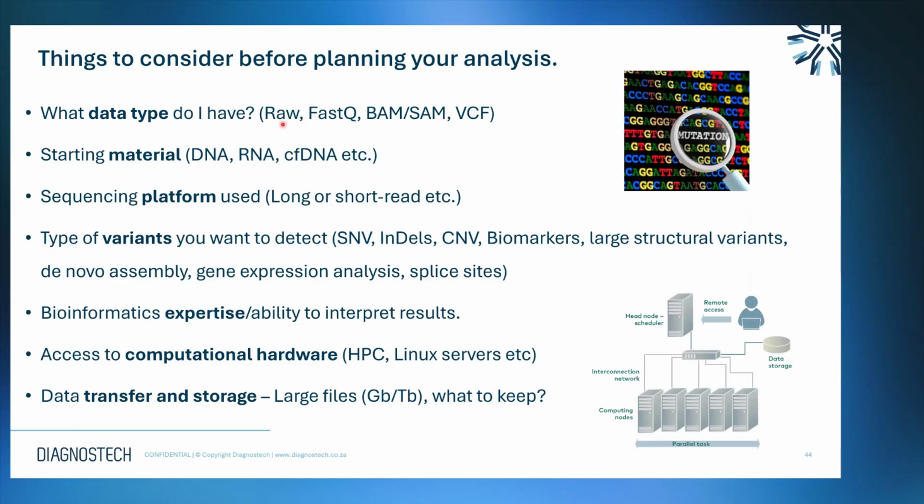You should know things like, what data type do you have for analysis? Are you starting with raw data that needs to be demultiplexed? Do you already have FASTQ files and you just need an alignment tool? Or have you already done variant calling and you just want to be able to determine the clinical interpretation of those variants? It's good to know your starting material.